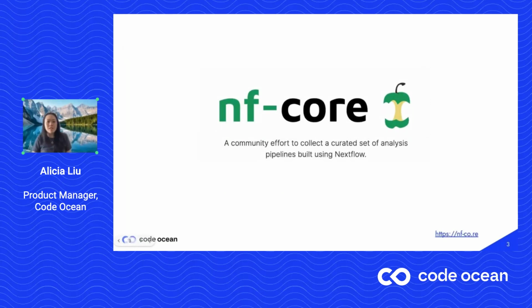For those of you in the audience, if you're joining us today, you're probably either already an NF Core or Nextflow user, or you've probably heard of them, have some interest in working with these tools, and you're curious to learn more about how to get started quickly and easily. So let's start with what exactly is NF Core. On the screen, this is the tagline that you'll see when you go to the NF Core website. It is a community effort to collect a curated set of analysis pipelines built using Nextflow.